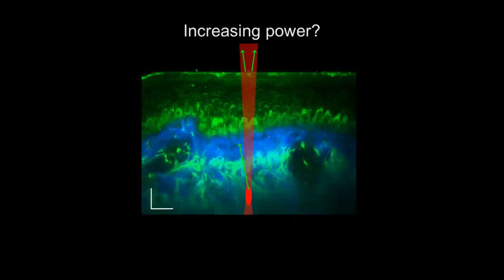So you said that the second harmonic generation is from the NADH. No, second harmonic generation is exclusively from collagen 1 in this case. The two-photon fluorescence is from NADH. Just looking at that picture, why don't you see second harmonic generation from melanin, or is there no contribution to that? Melanin has no second harmonic generation. Only two-photon fluorescence from melanin. The melanin fluorescence is not picked up here because it actually occurs at longer wavelengths more efficiently. So this is predominantly an NADH picture here, from the two-photon fluorescence.